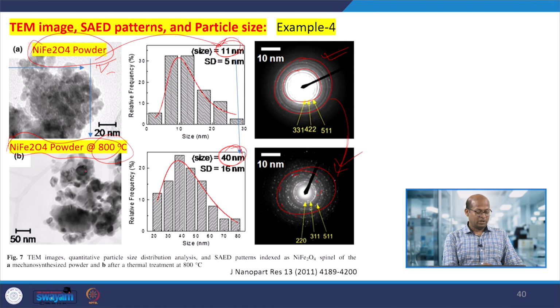At the same time, you can collect individual spots, and with that, for the particular size of nanomaterial that is formed, you can categorize by counting the numbers. Here you can see the size in nanometers of the particles that form. Within that range, 30 percent of this size of nanomaterials forms.